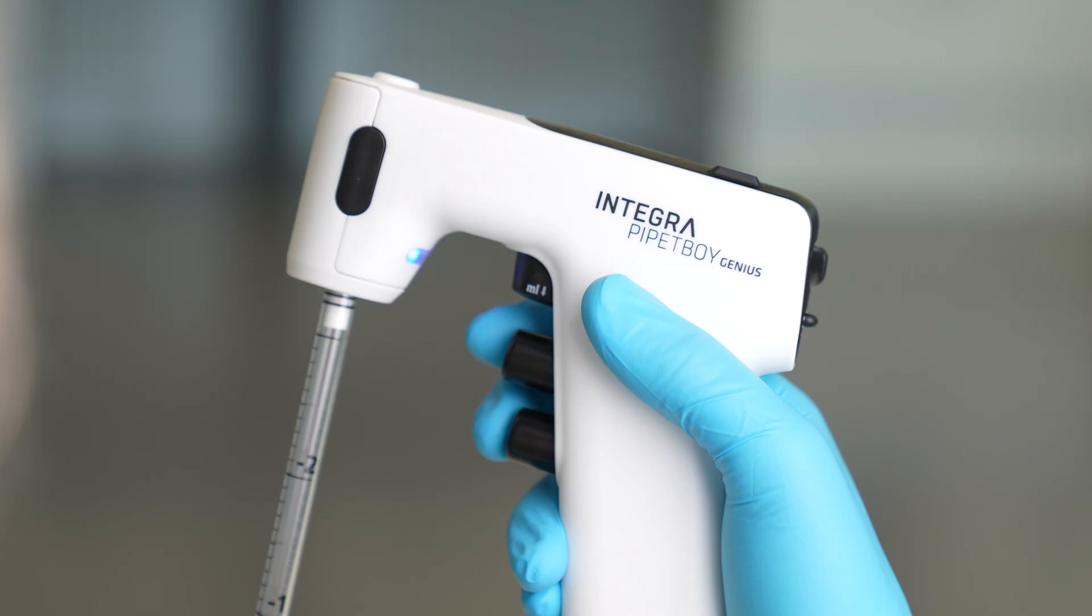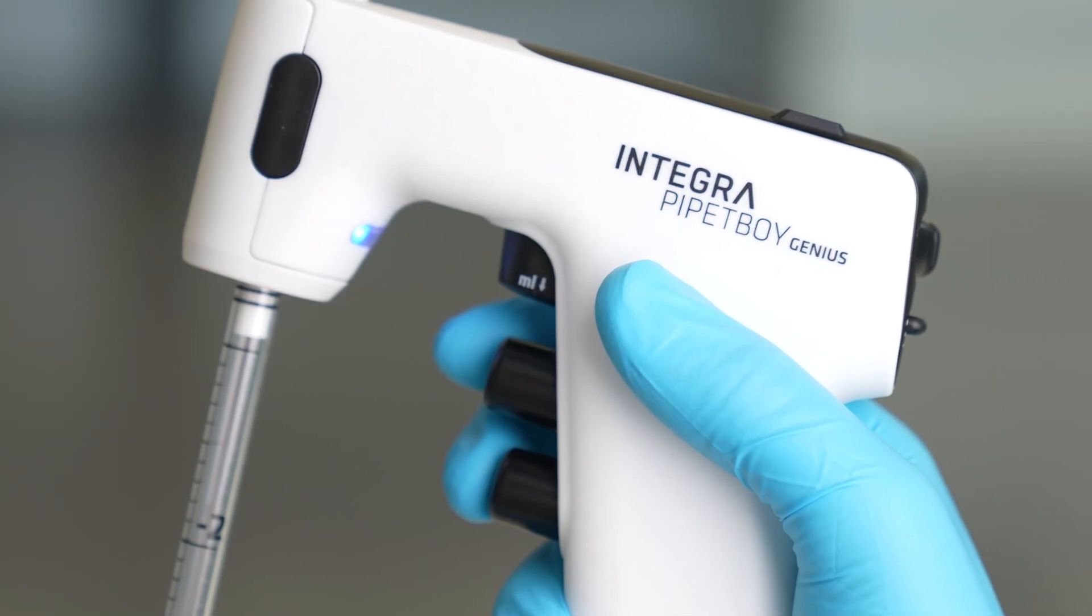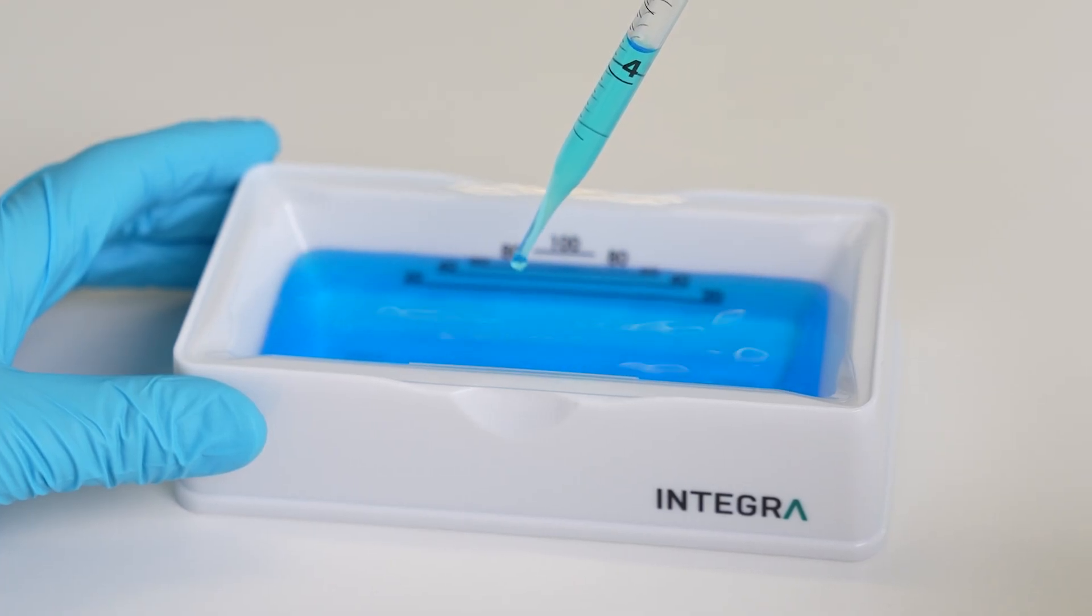You can then regulate the speed by varying the pressure applied to the aspirate and dispense buttons. The harder you press, the faster the liquid transfer, up to the defined maximum speed. A gentle press allows you to dispense drop by drop until the last drop.